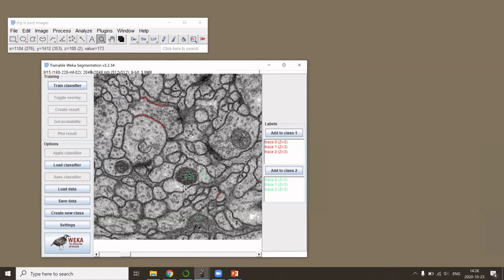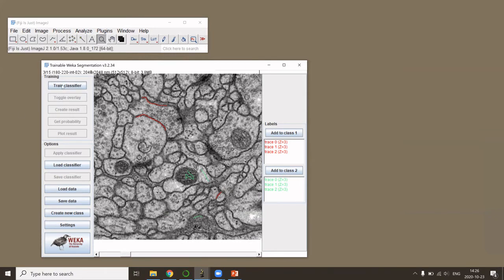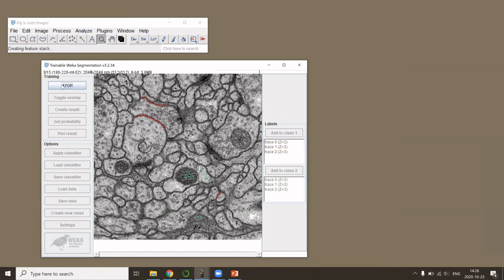Of course I could continue now, but this is a demonstration, so I stop here and say I would like now to train the classifier.